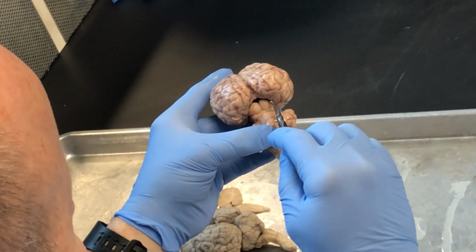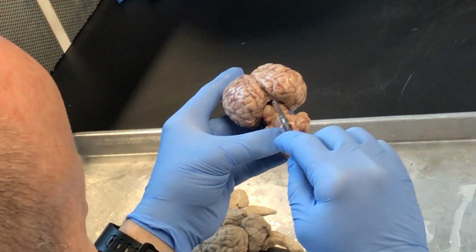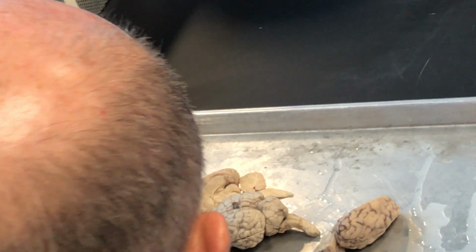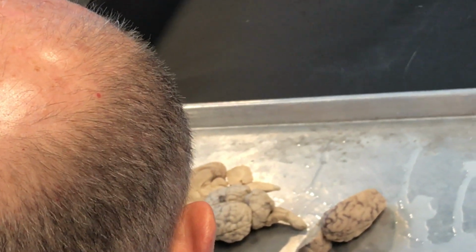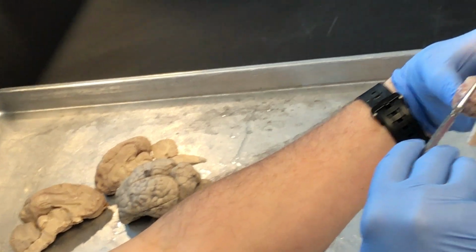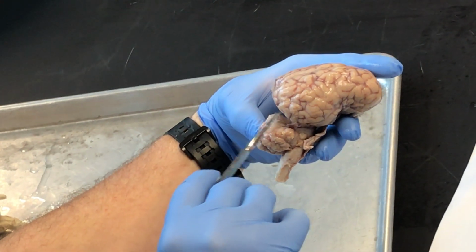The two upper ones are called the superior colliculi, and they kind of look like butt cheeks. Okay? Right there. Two superior colliculi, two inferior colliculi.